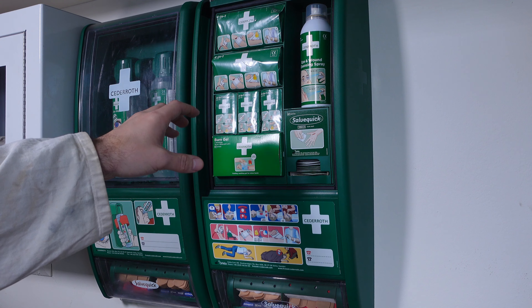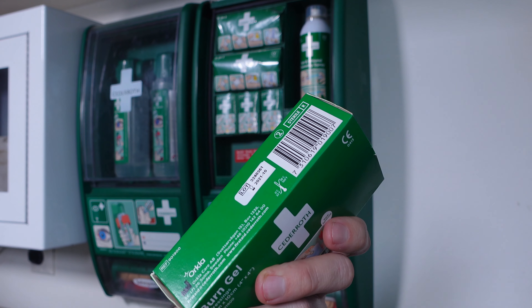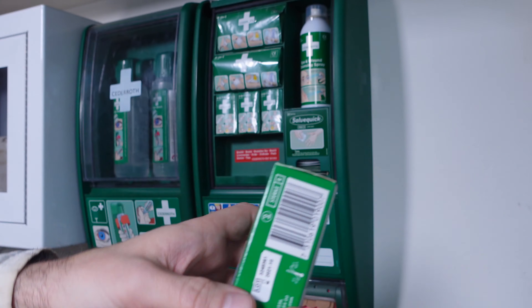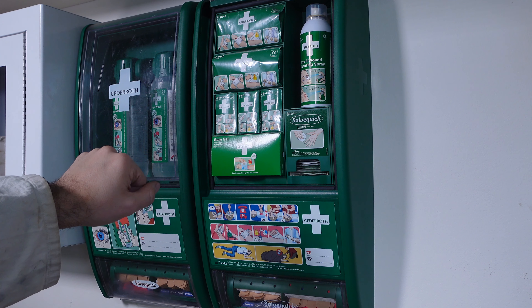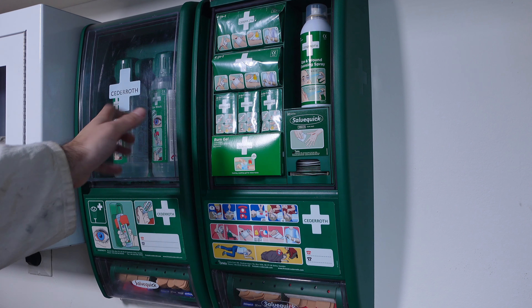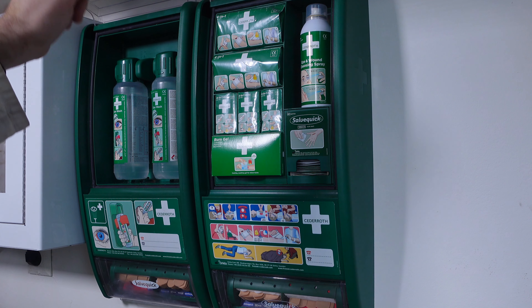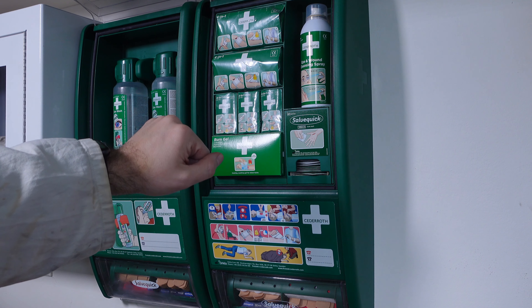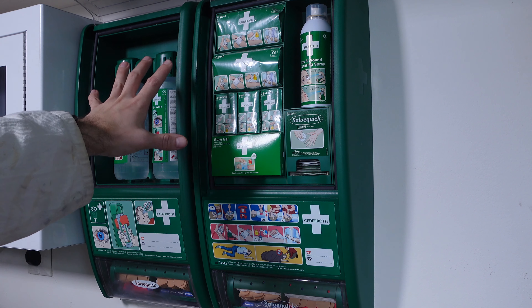You've got absolutely no problem purchasing a whole refill to get a new date on each element, and if you take a look you've got the expiration date as you can see. So we are going to be replacing it with a brand new one — that's going to be my gain. Let's take a look at what we've got: two first aid stations.